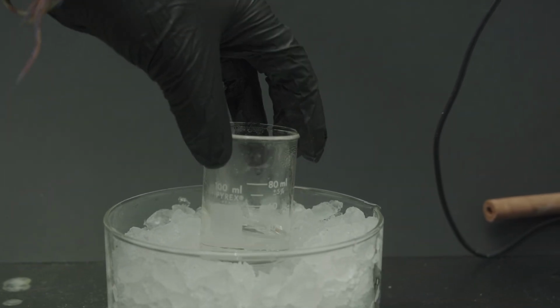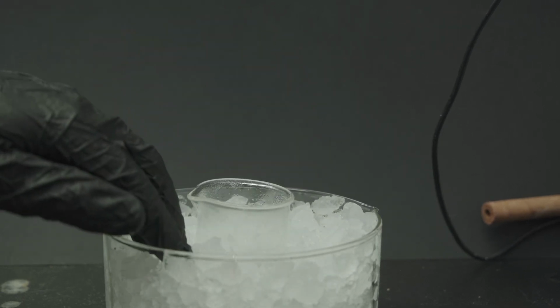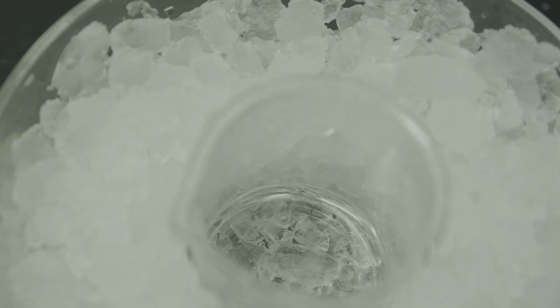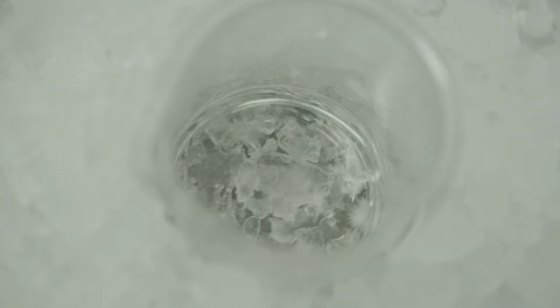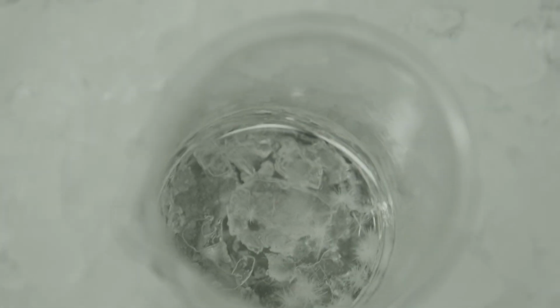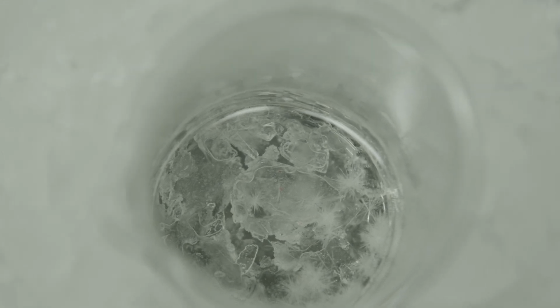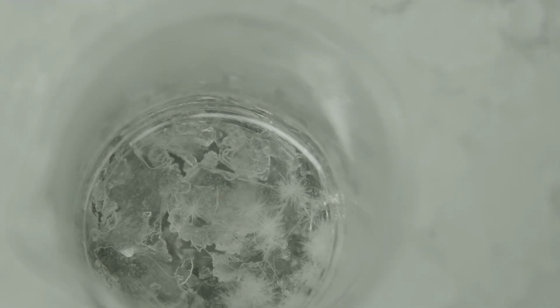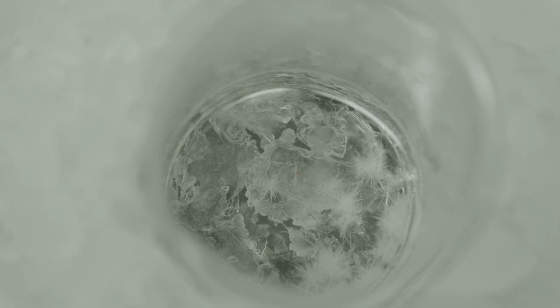All I had to do was put my solution into an ice bath. This would promote crystallization of what hopefully would be aspirin. Crystals quickly started to form at the bottom of the solution, and this made me excited because last time I hadn't really gotten any proper crystal growth. There was still a chance that it hadn't worked, but I still had my hopes up for this trial. A really cool snowflake pattern kind of seemed to take over, but by the time that it was done crystallizing, there was almost no liquid left.